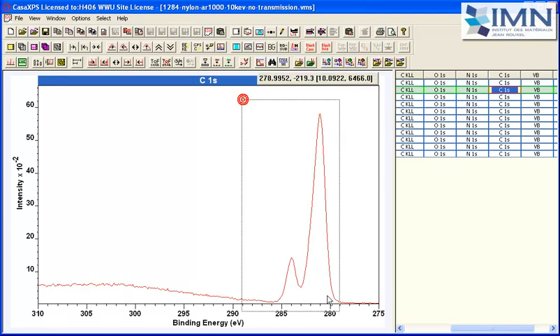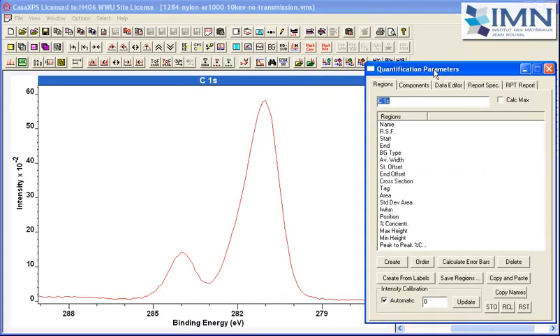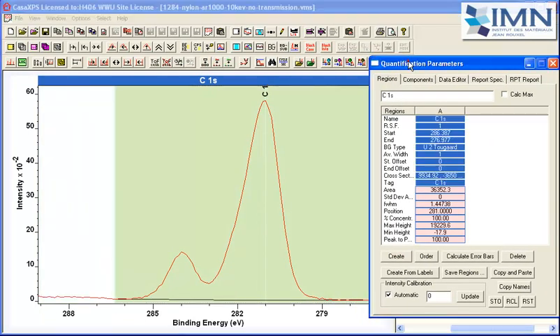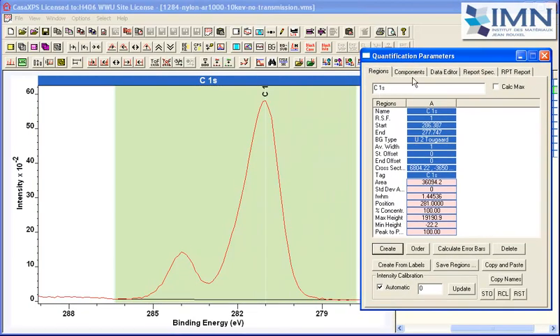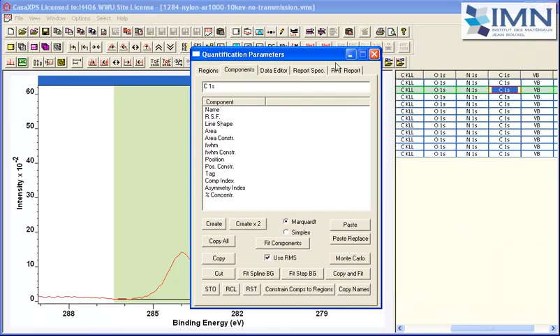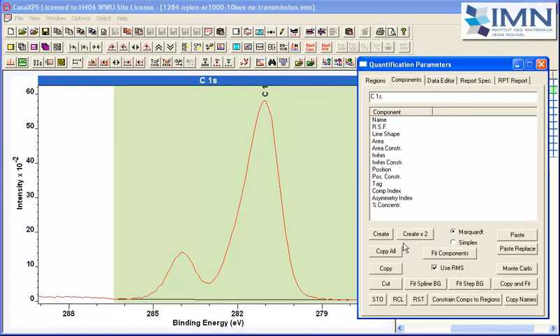Once again, when you measure by XPS a nylon sample and you concentrate on the C1s signal, you end up with a data envelope that is a combination of chemically shifted C1s peaks. So let's create a background, and we'll now create a peak model that will represent what we believe this to be. I've chosen the second one rather than the first one, so that there was a greater indication that we had nylon following the first etch cycle.